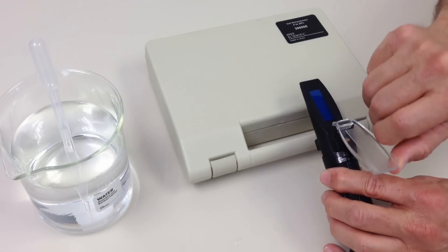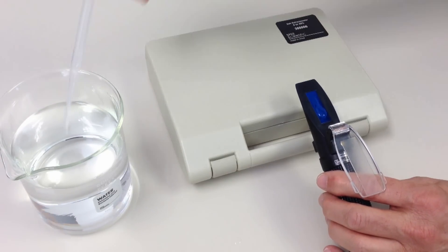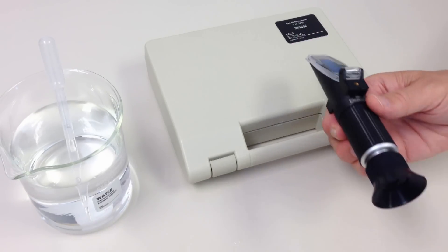To take a reading, simply place a few drops of your sample solution on the refractometer prism and read results immediately on a bright, clearly defined scale.